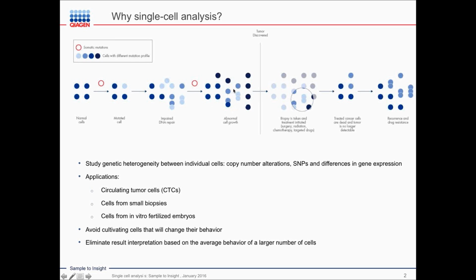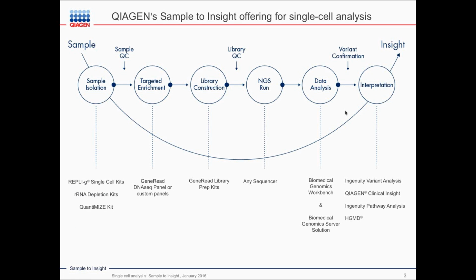And if one is using information about those cells to direct treatment, it's important that you have a strong understanding of the individuals. This will become even clearer as we look at the results that we have for the population of cells that we're looking at in this single cell analysis.